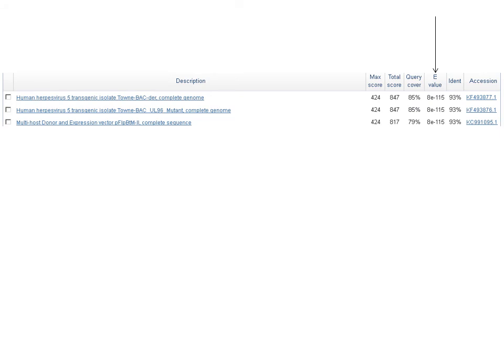Once you get through that and it's found your data, it's found some hits. On this search that I did, I don't remember what sequence I entered in, and this is too small for me to read even with my glasses on. It'll return hits. It'll tell you the title that was given the sequence by the investigator that first entered that sequence. So these researchers sequenced a gene from some organism and then entered that sequence in, and this is how they titled their sequence. And you can get some information from that. But over here are your results. These are the important results for your project.